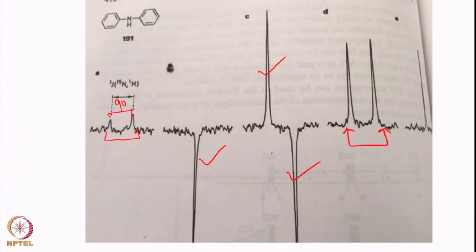If we do INEPT, we get this signal, and if we do refocused INEPT, both signals will now be positive, and that is what we have here. So, by doing selective polarization transfer and INEPT, we are certainly getting an enhanced signal, and that enhancement is substantial. Here is just the normal signal, here is selective polarization transfer, and because of INEPT and refocused INEPT we get all positive signals. If you compare from here to here, we are getting a substantially enhanced signal. That is what polarization transfer in INEPT is all about.